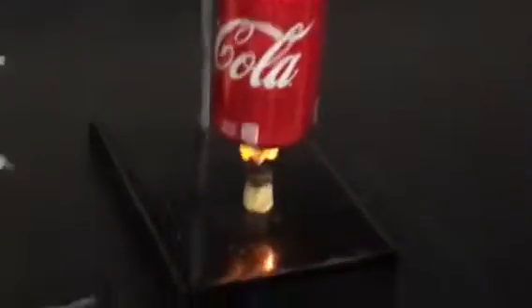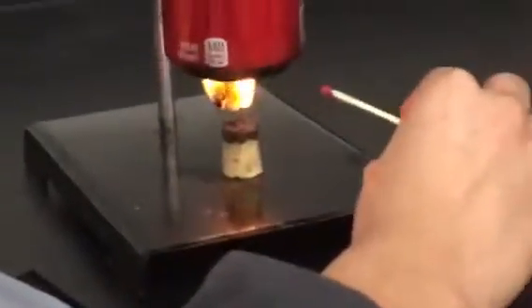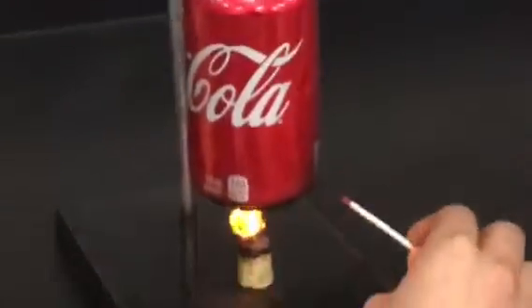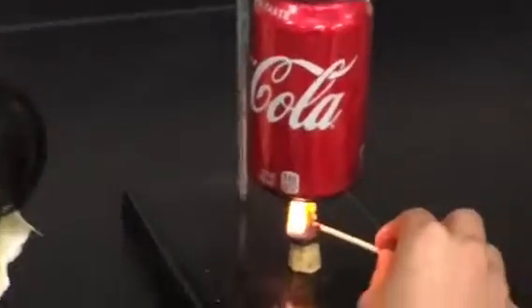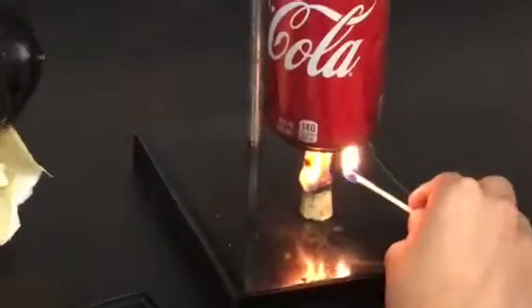Alright. Look, it's burning. It's burning fast. You gotta save it. Yeah, because it has butter on it. At the bottom, save it. It's not dying though. There's still white, there's still yellow up in there, and it's not burning fast. Oh, damn. There you go. Bro, it left a little melt.